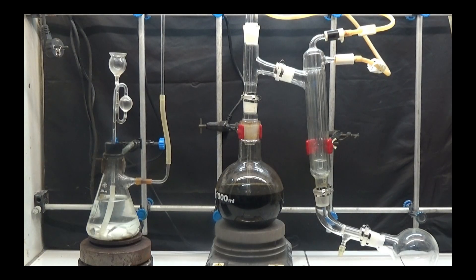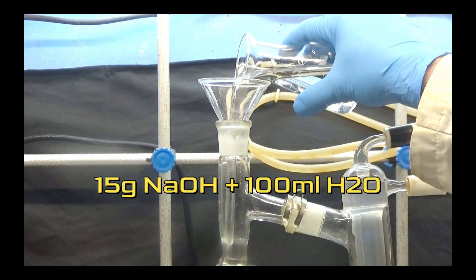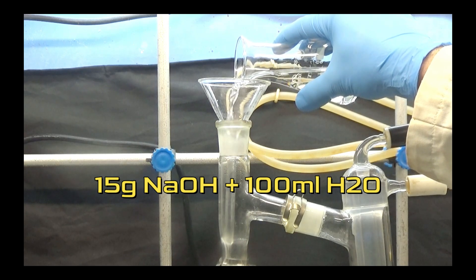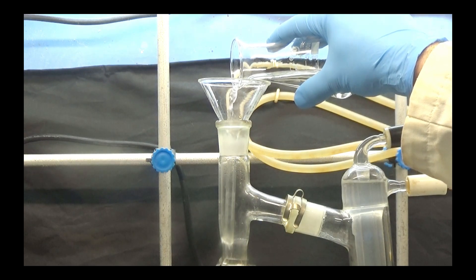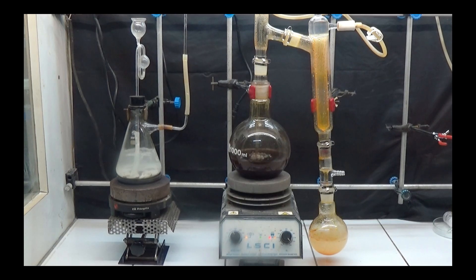Set up steam distillation equipment with a 1000 milliliters flask. Pour the filtrate into the flask and add a solution of 15 grams of sodium hydroxide in 100 milliliters of water. As much methanol as possible can be extracted by vacuum distillation. After distilling all the possible methanol, we connect the steam and distill.